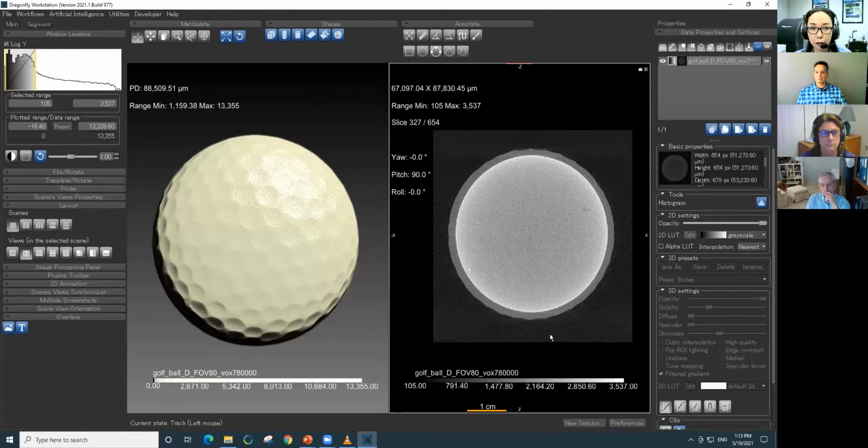Now, we're going to ask you a question. I mean, Angela is going to ask you a question. What would be reasonable steps to take to do thickness distribution analysis for this? Oh, Angela, I think you're muted.